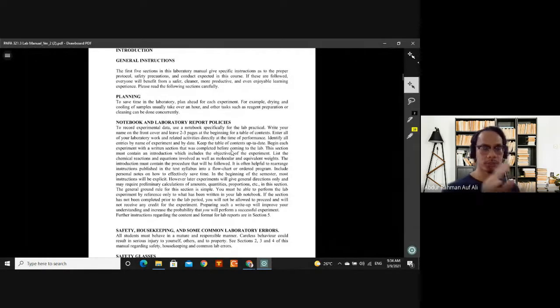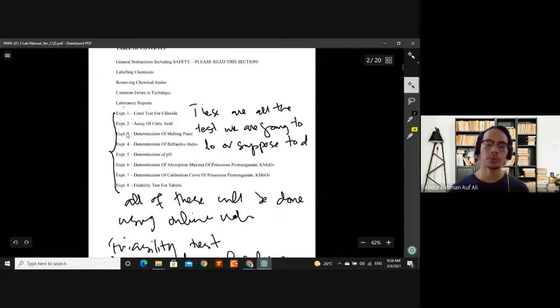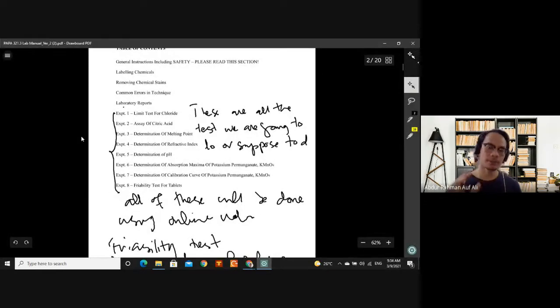But in our module, in our syllabus, all these experiments, we don't use any higher concentrated corrosive chemicals. Everything is very diluted, so it will not produce a very large amount of fumes, dust or particles that will affect us. So a surgical mask is enough.